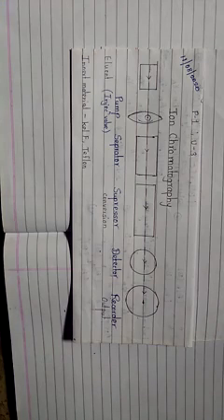Now we move towards the instrumentation. Here first you see the eluent. Eluents are not the same for this method. Just we saw that it's a cation or anion exchanger.